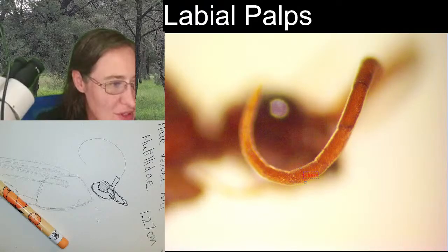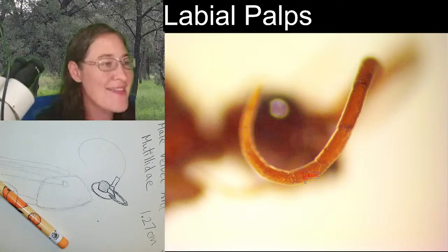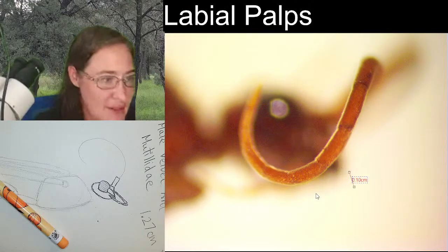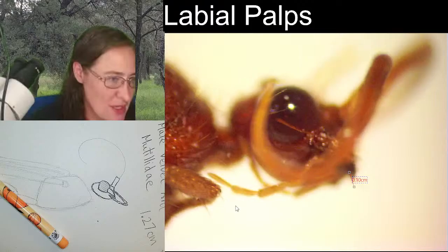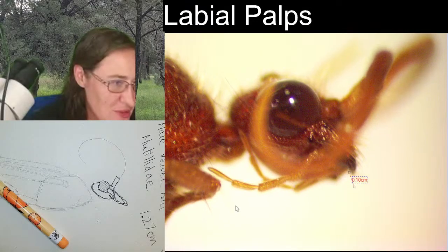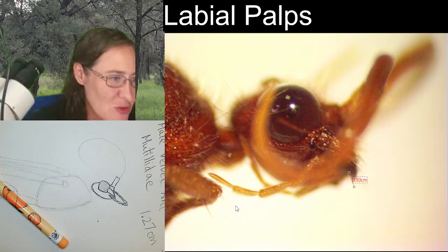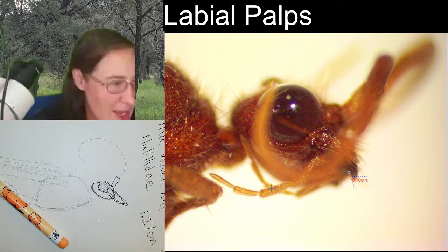All right. So at this focus, the width comes out to 0.1 centimeters. It's not actually 0.1 centimeters, but that's just at this focus. What I can do now, at this zoom level, is measure this one, and I can give you a ratio.